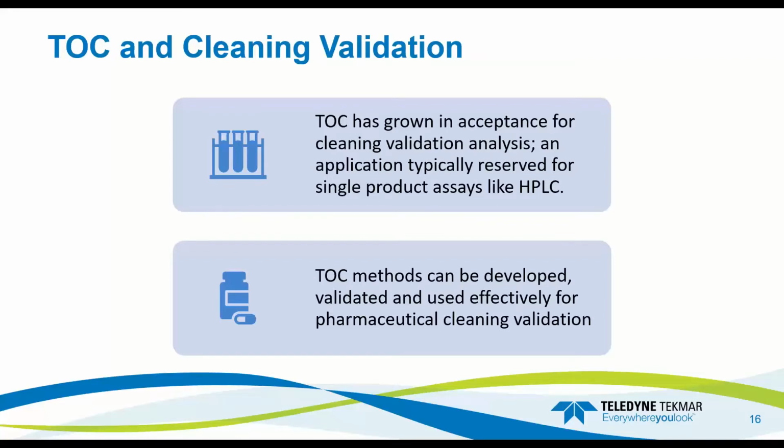We work directly with certain vendors or manufacturers to ensure their IQ, OQ, PQ is set up properly and their system is validated, and then they run their waters on our system. There are two steps of a cleaning validation. One, you must run your rinse water, and two, you must run your swabs. It's a very simple process, and TOC can handle both of those sample types.